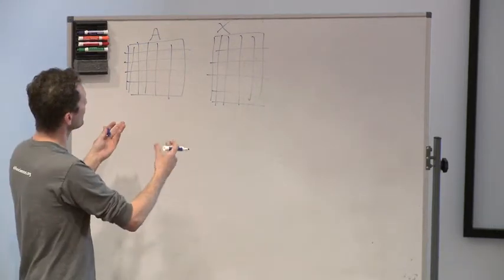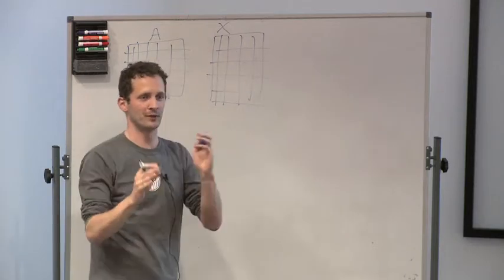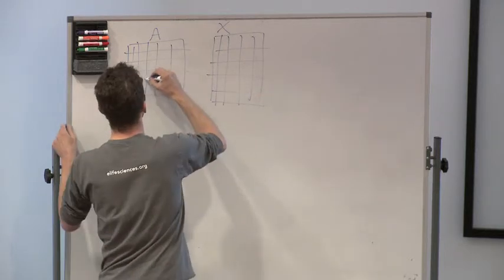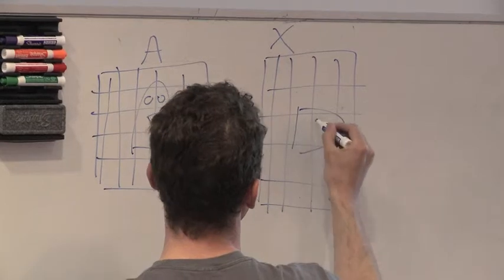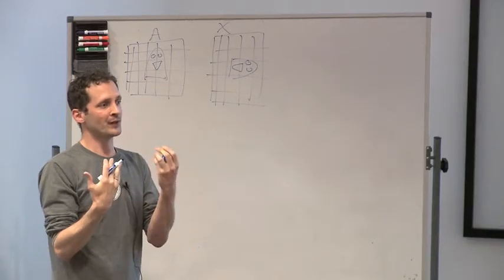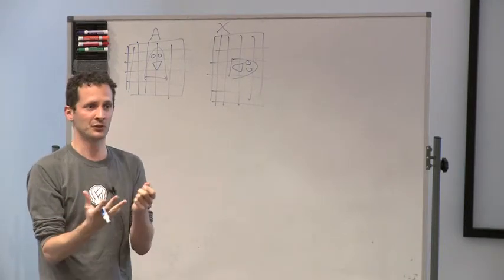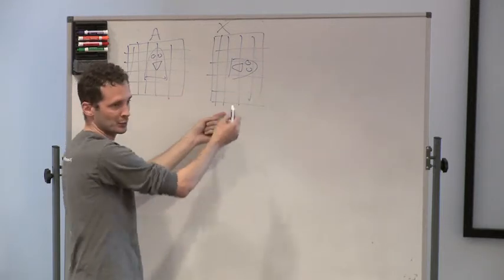Now, what we need to do is rotate, and rotation will involve some interpolations, etc., which I will not go into detail on again, okay? But we have our little penguin there, and we have another one there, okay? Now, what we need to do is define some number, because that's what computers are good at, to describe how well this picture fits with this one, okay?